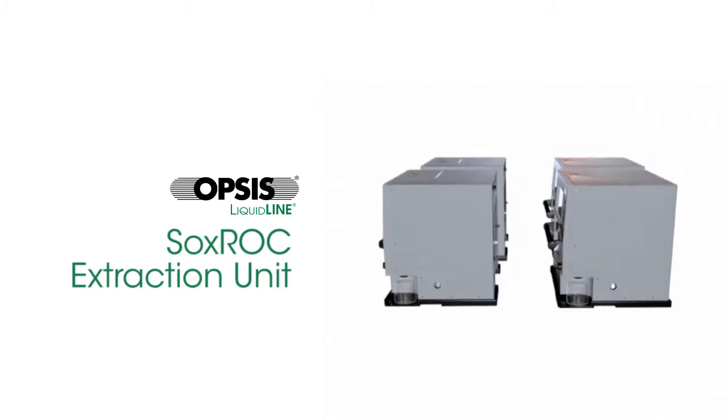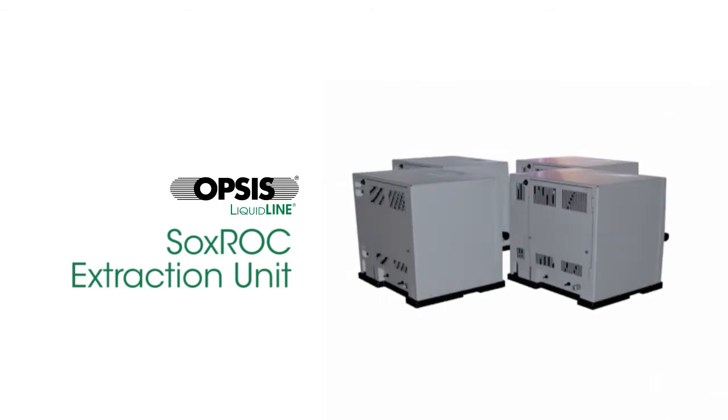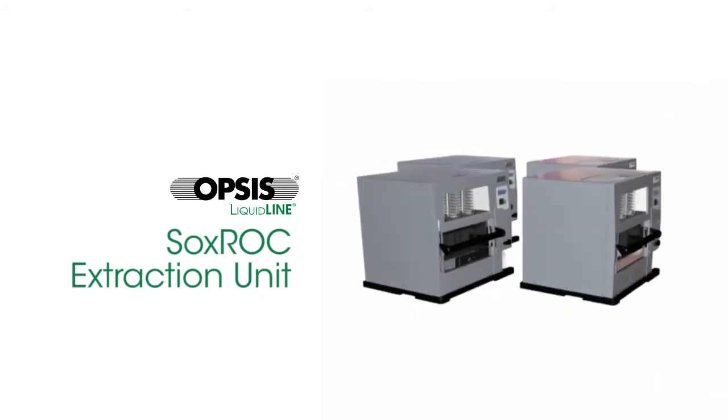OPSIS LiquidLINE innovates wet chemistry. The SoxROC extraction unit is the result of years of development by engineers in Sweden.